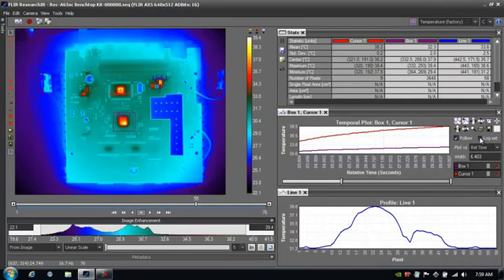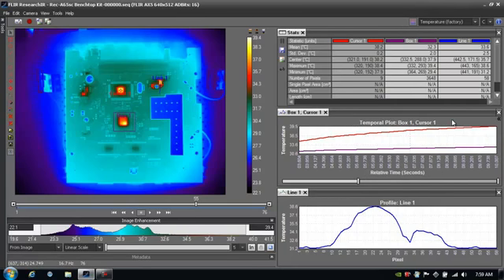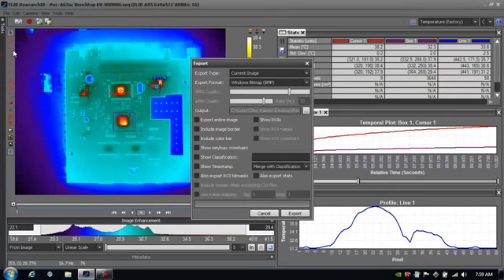And then I also have an option here to log the data set directly to a text file. So maybe I'm looking at live data, and I can be data logging this in real time. But I'll go back and go up to File Export and look at some of the ability to export the entire image.